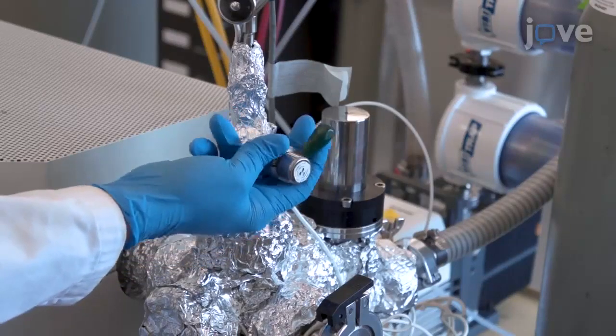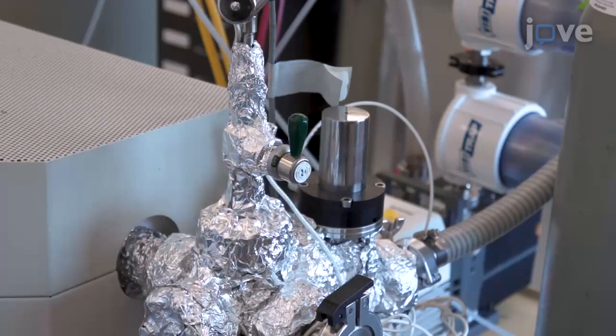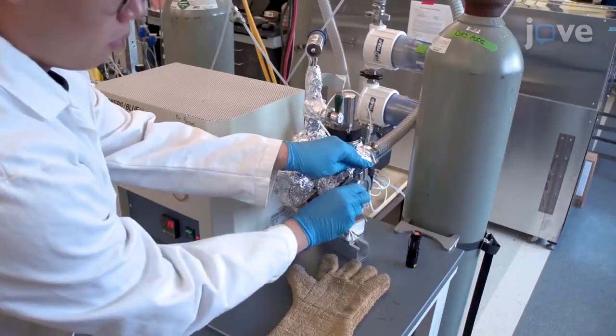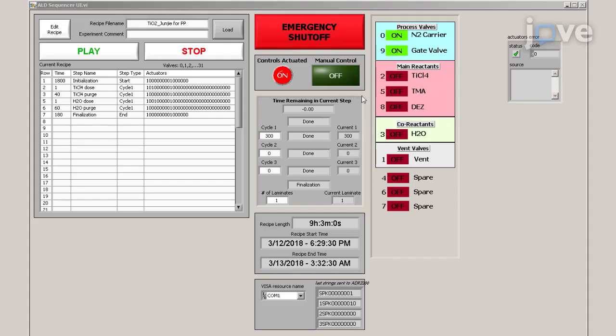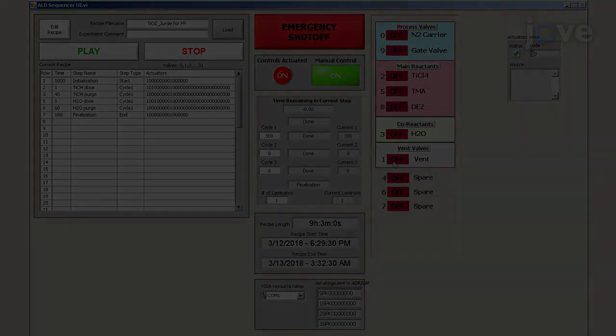Upon completion of the recipe, open the pressure gauge. Remove the clasp from the reactor cap. Turn on manual control in the system. Following this, close the carrier nitrogen and gate valve on the ALD reactor.